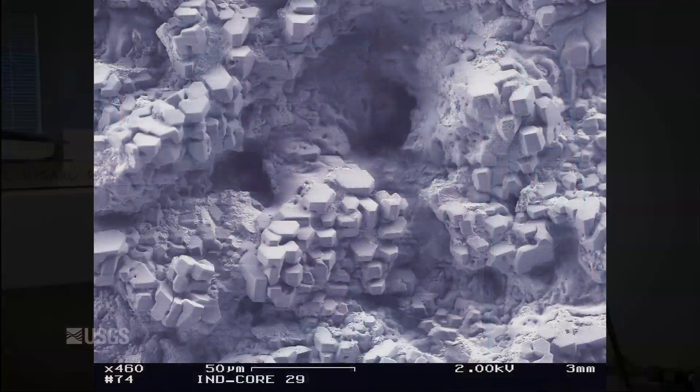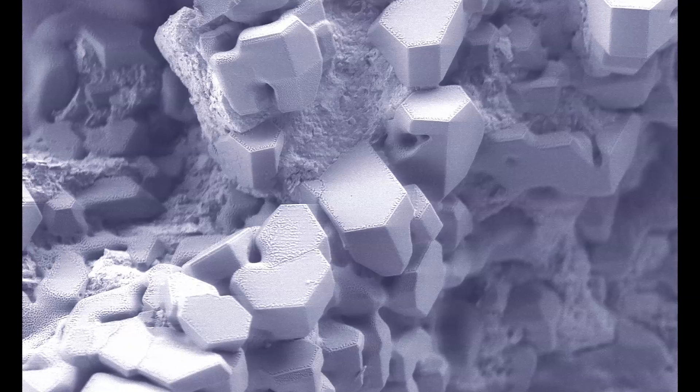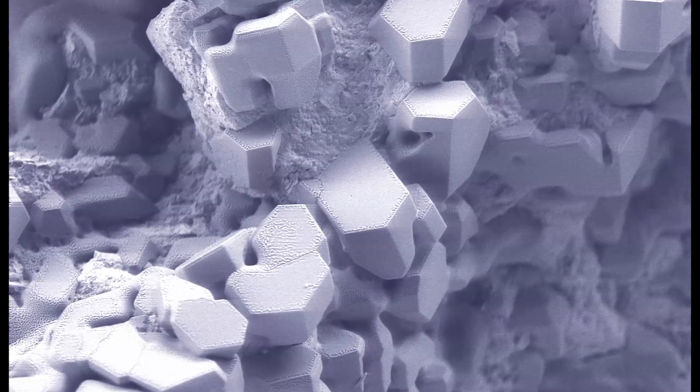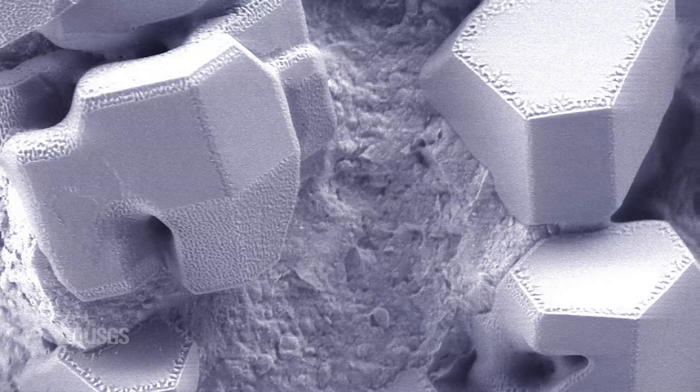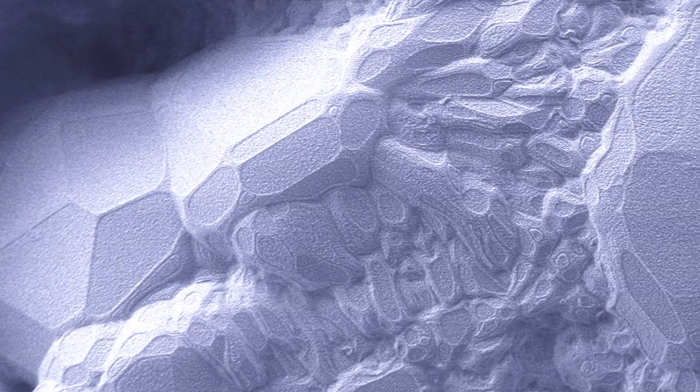This laboratory is unique in that we have the low-temperature capabilities to make different sorts of ice samples, gas hydrates, or ammonia hydrates — both planetary ices and gas hydrates. We also have unusual capabilities in how we look at those samples afterwards, with cryogenic capabilities on our X-ray diffractometer, as well as a cryogenic setup for scanning electron microscopy, where we can look at grain textures, pore structures, and how samples interact with sediments.